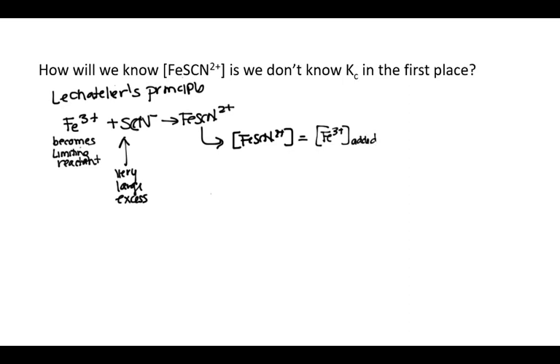Now, when we mix these together, we need to consider any effects of dilution. And remember that you can calculate dilution from M1V1 equals M2V2.